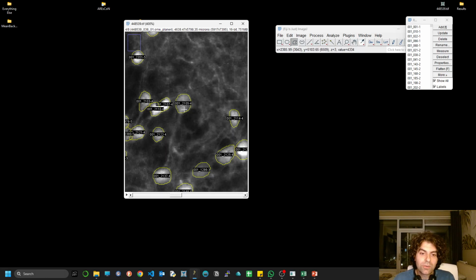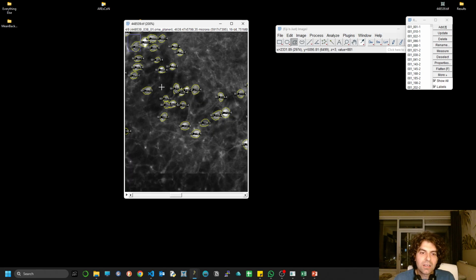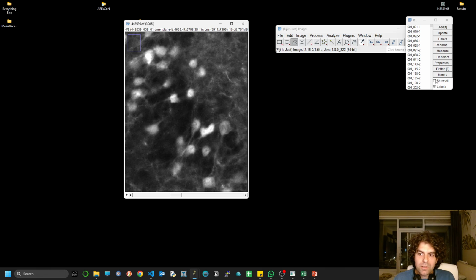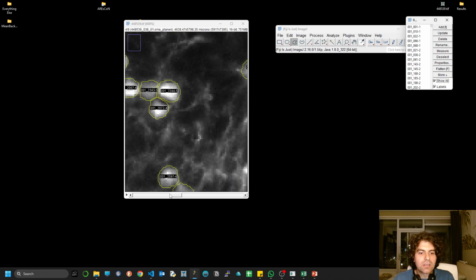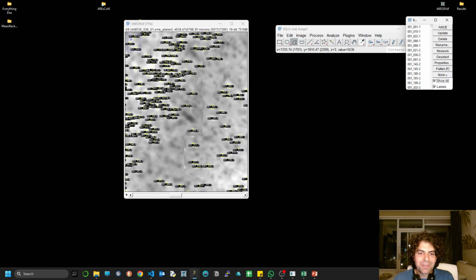And if you go to plane 4, you have a crisp image. You go to plane 5, it's not anymore. You go to plane 3, it's not anymore, right? And you can see that some are on plane 5. You go to plane 5, indeed, it's a bit crisper compared to plane 4, someone could argue at least. Sometimes it's not extremely accurate, but most of the time it's very accurate, which is really nice to see, working so beautifully. And you see all these label names.